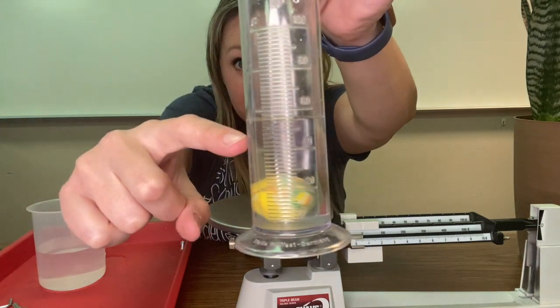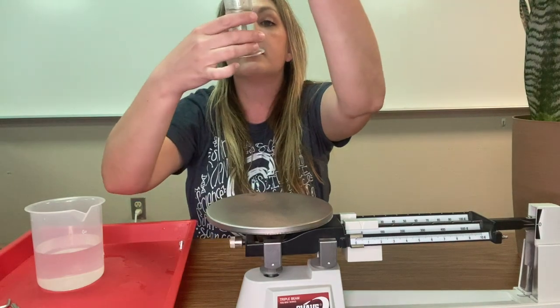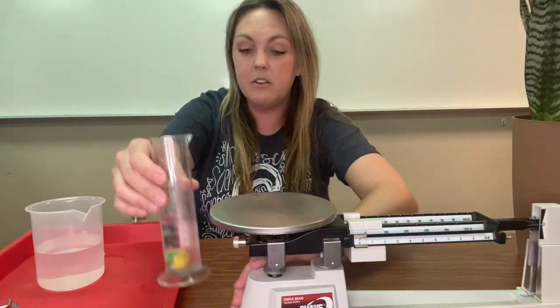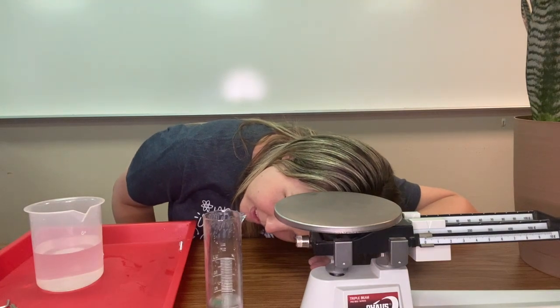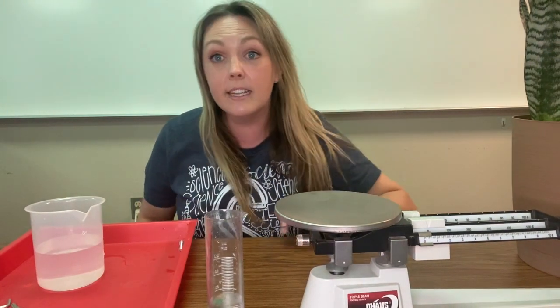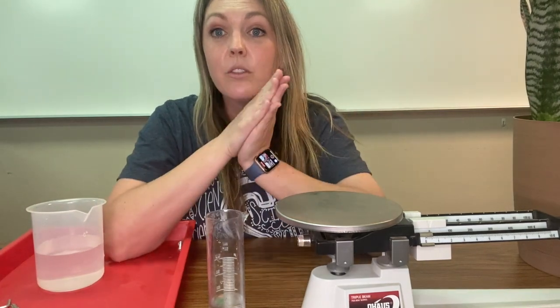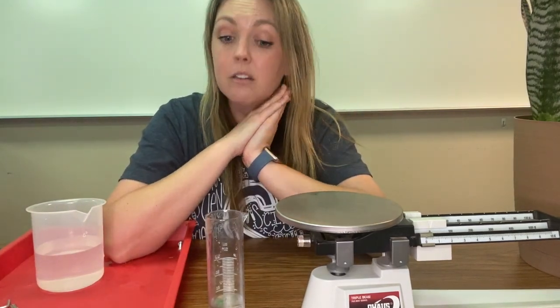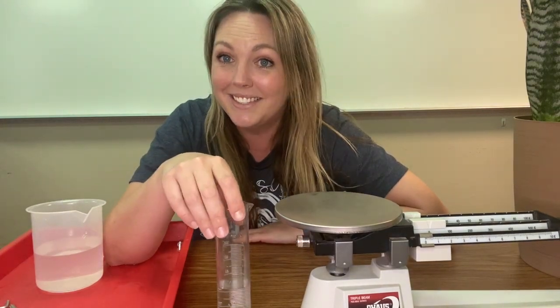That jumped up! 50 is here — let's see what it is. Measuring down here: 52, 54, 56. We started at 50, we ended at 56. So the volume in milliliters of this bouncy ball is six milliliters.